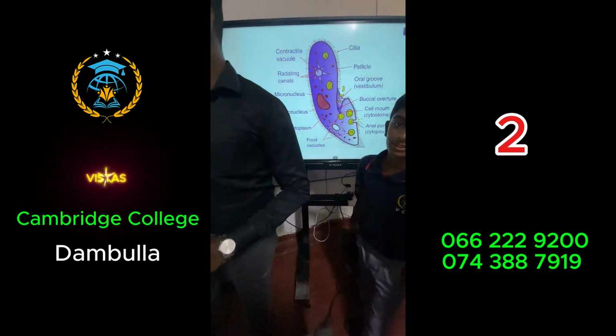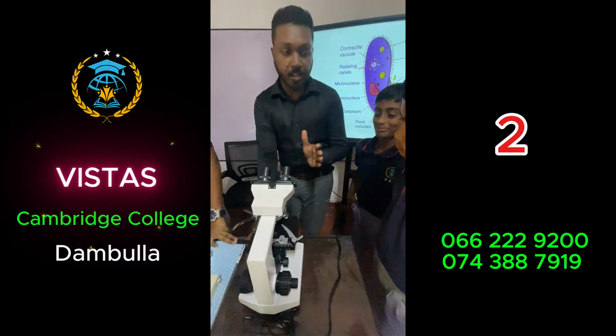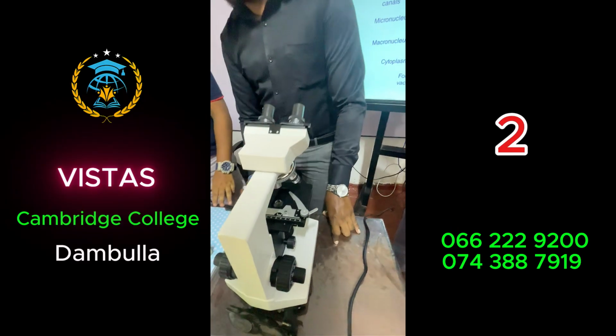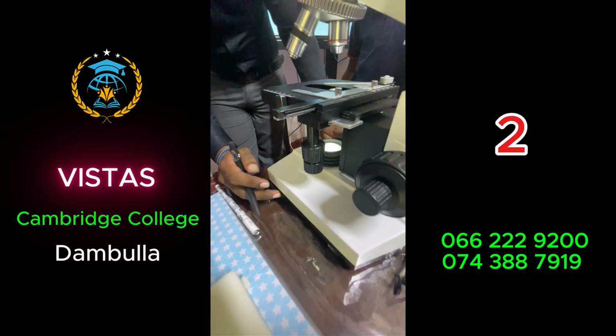So this is the optical microscope, not like other microscopes. This is a completely advanced microscope. Okay, so you can see this needs to be connected to the current, and there's a switch here. You can turn it on, right? Then you can see the light is here.